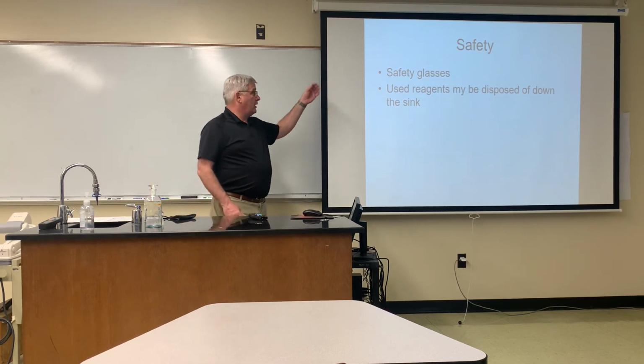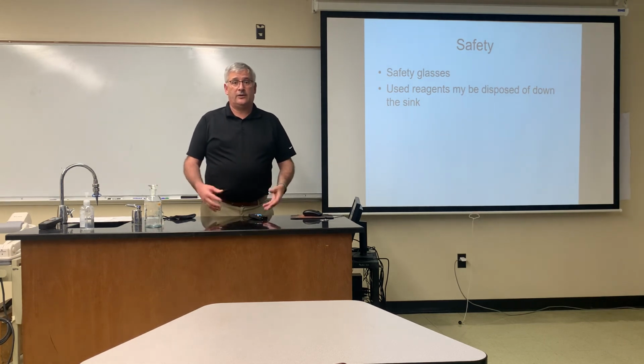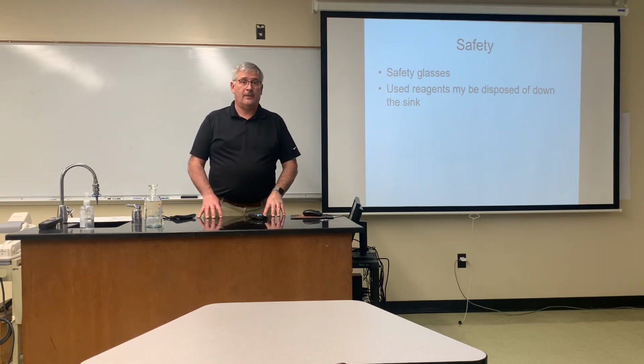This week we're going to wear safety glasses, and our reagents for this week can actually be disposed down the drain, okay? So I'm looking forward to seeing you in lab. Good luck on your quiz, and have a great day.